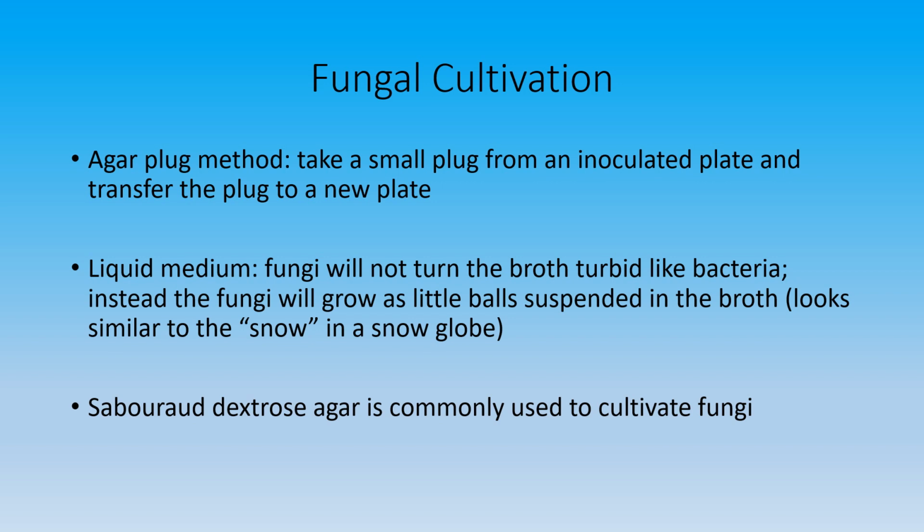If you're working with a liquid medium, if you remember, bacteria, when they grow in a liquid medium, like in a nutrient broth, they will turn it turbid or cloudy. Fungi don't do that. Instead, when fungi grow in the liquid broth, the liquid's going to remain clear, but they grow in little tiny balls that will be suspended in the media. So if you want to transfer something, you're going to want to make sure you transfer some of those balls. As I said, it kind of looks like the little snow particles in a snow globe.